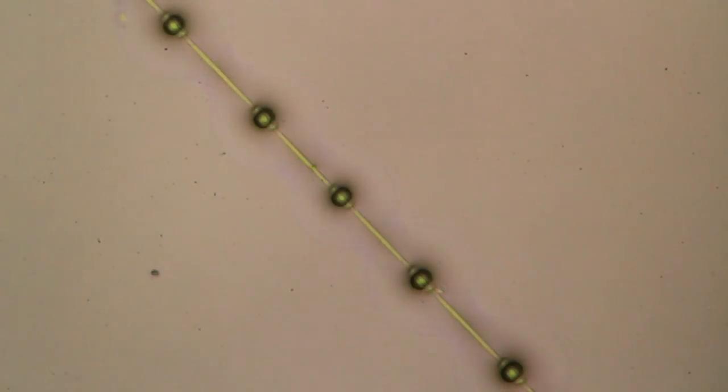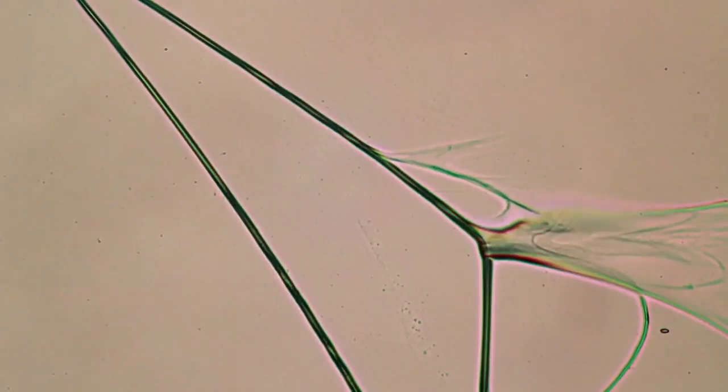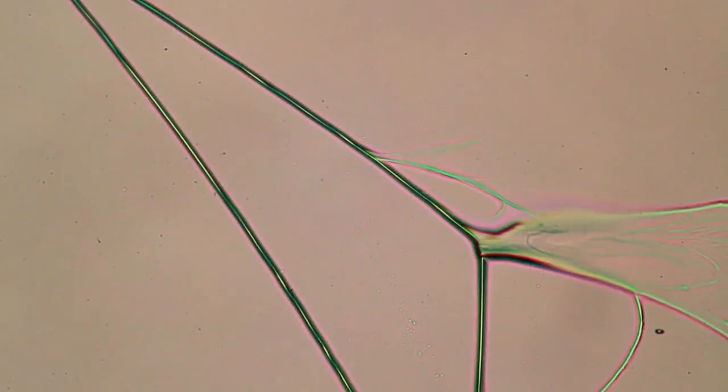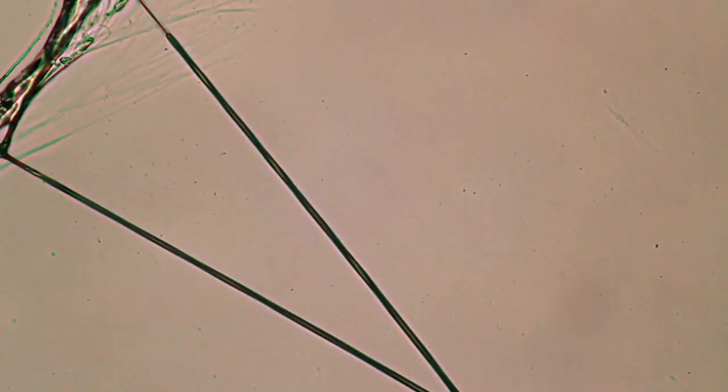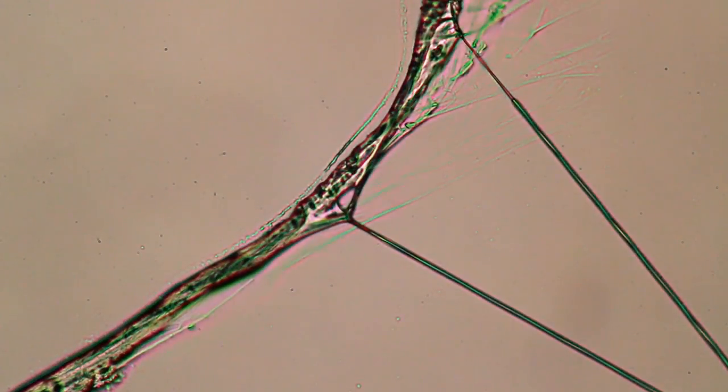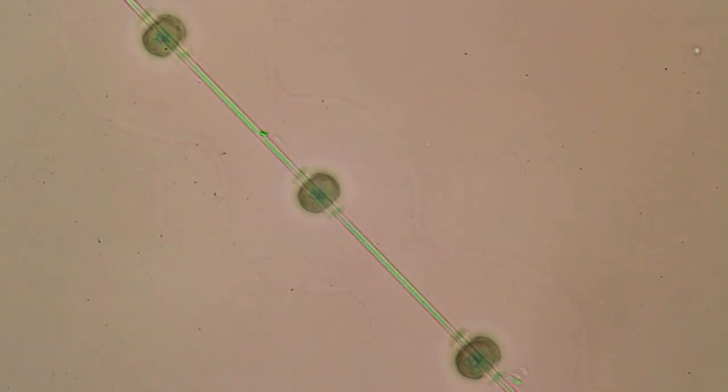The glue has been actually pulled away from the microscope slide, here slightly in bigger close-up and yet again. Those threads, they are quite strong as a matter of fact - compared to the thickness they're even stronger than steel. Here again the halo is quite well visible, of course not a halo but that's glue that has diffused across the microscope slide.